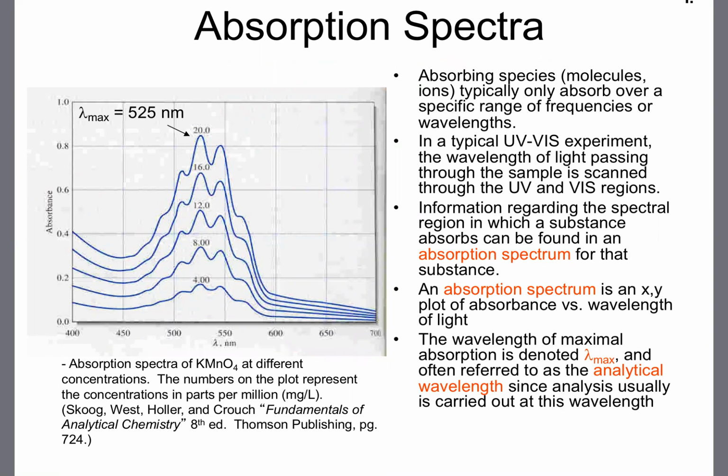We'll get more on that in a few minutes, but what we want to do right now is learn why this absorption spectrum is interesting to us, okay? Well, the reason is because it provides a graphical depiction of where this molecule absorbs light strongly. And that's what I want you to understand. Because we plot absorbance versus wavelength, I can quickly come into this plot and locate the peak absorbance, which is right there. And it looks to me that it occurs somewhere around 525 nanometers wavelength. So that wavelength, 525 nanometers, is the peak absorption by this material.